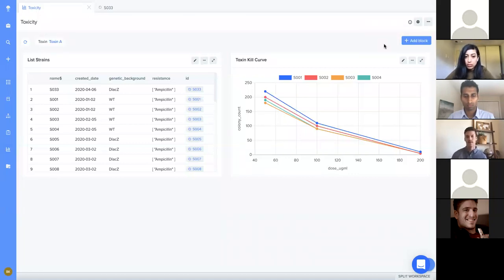And then lastly, I want to reiterate that this was done on a very small subset of the actual use cases that Benchling Insights can cover. And it was done with sample data that has no real world significance. And what makes me excited, and I know what makes Sanjay and the rest of the team excited about this, is that all of you in attendance today have real data that is of critical real world importance. And I think in times like this, it's important to make that data work for us, so that we can all as an industry come to new discoveries, new conclusions, and new therapeutics faster than ever before. So I'm really excited to see what everybody here is able to do with this tool, and supporting you all in the future.